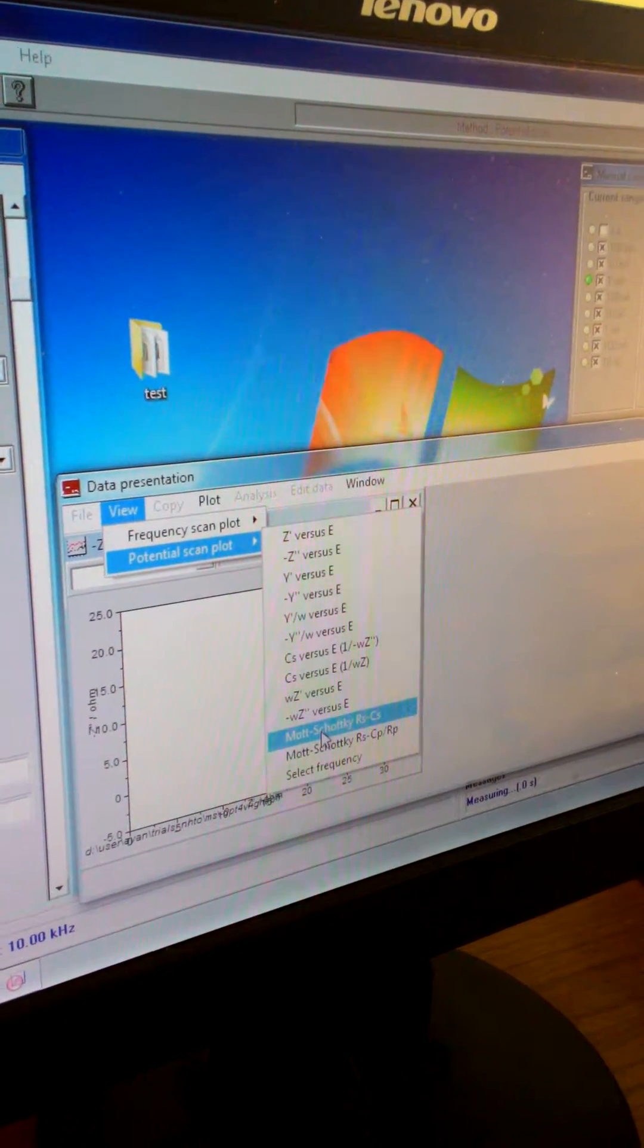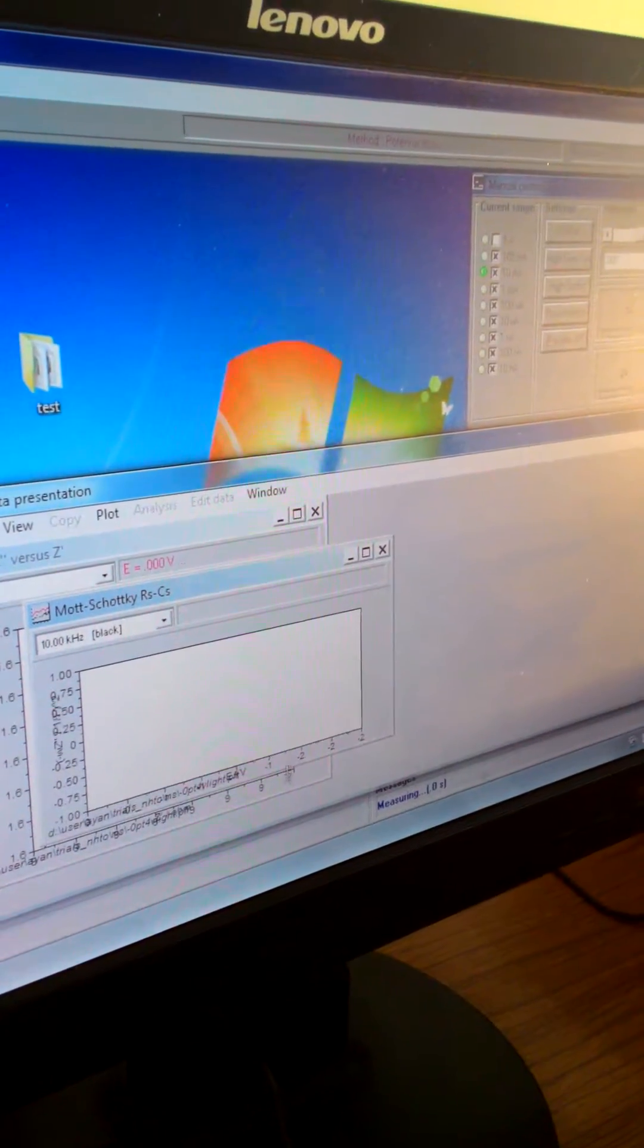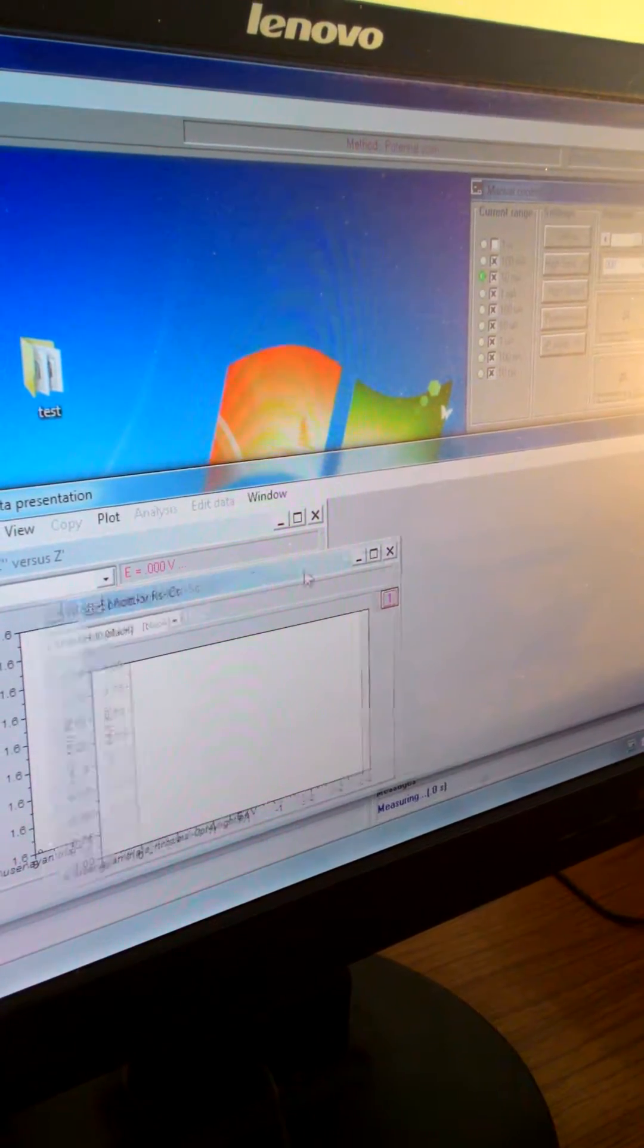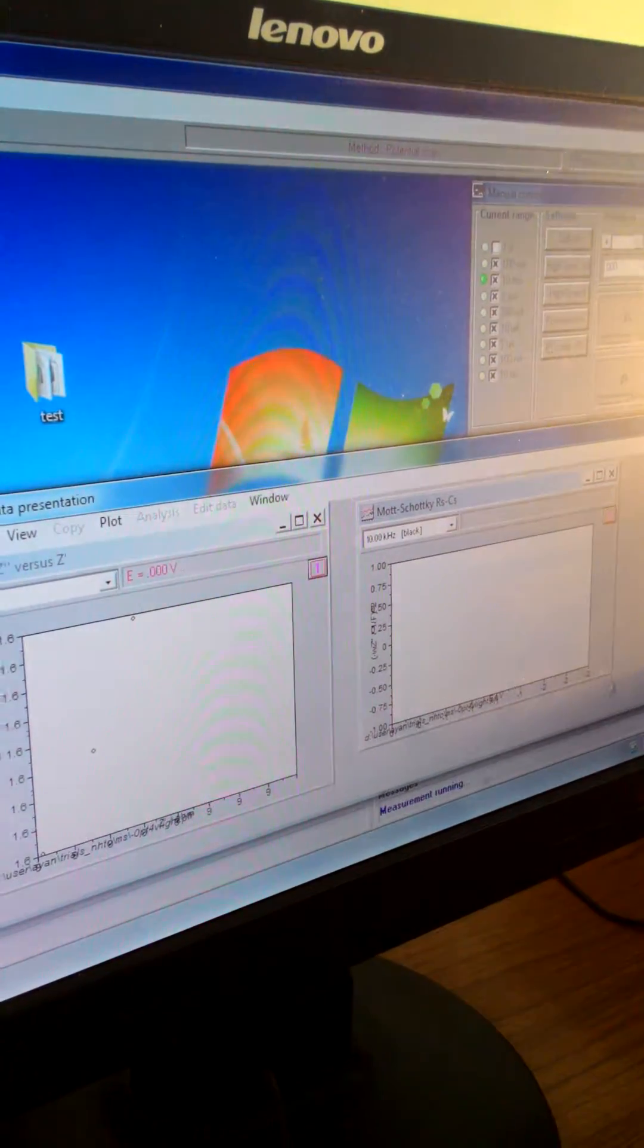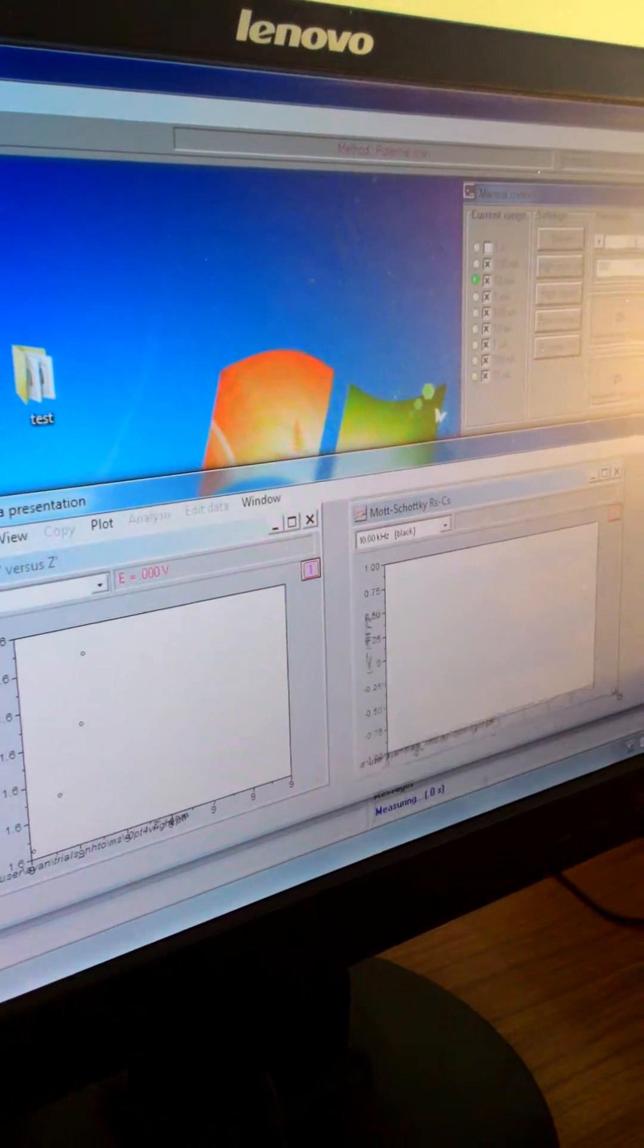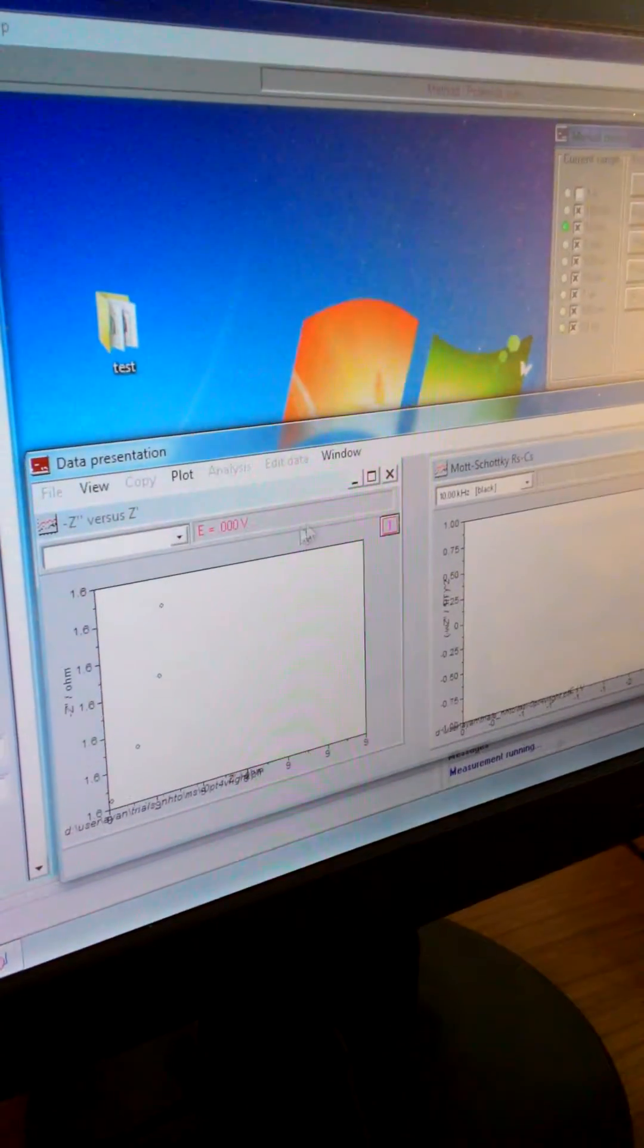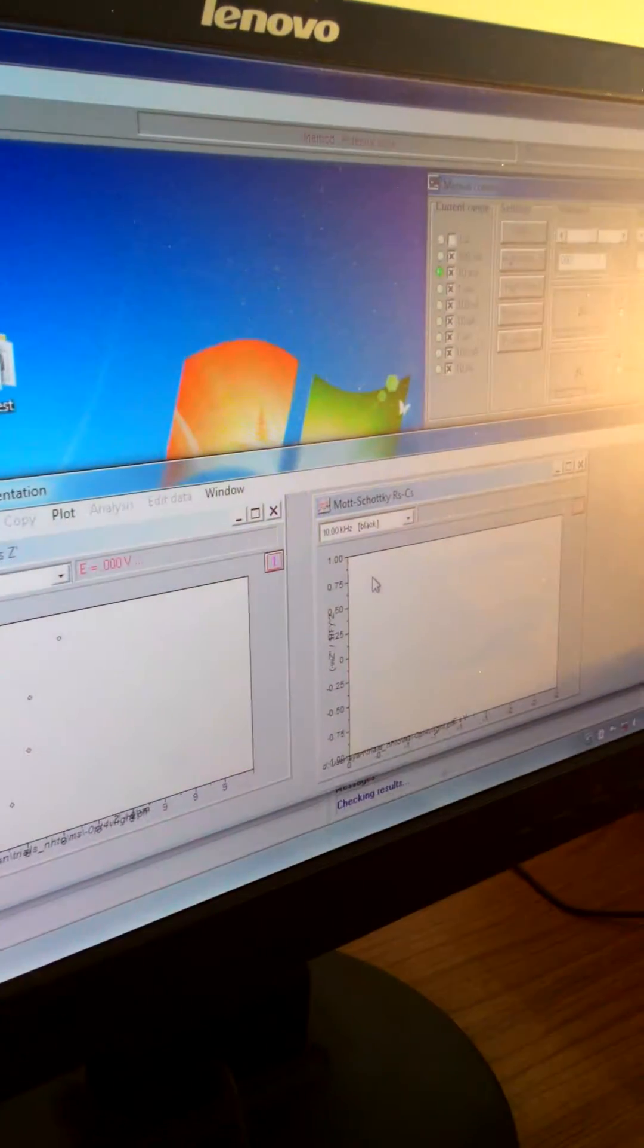Just click it, one other window will open. So for every scan there will be one point generated, one point generated in this mod sort key. The whole scan will complete this one, then one point will be here.